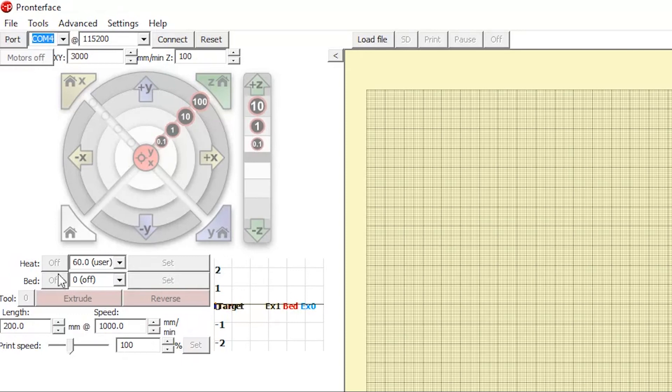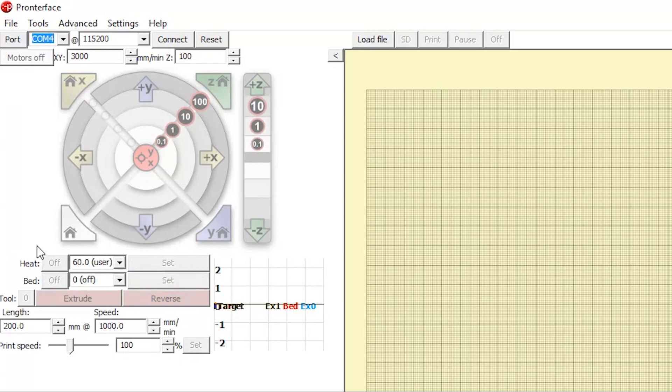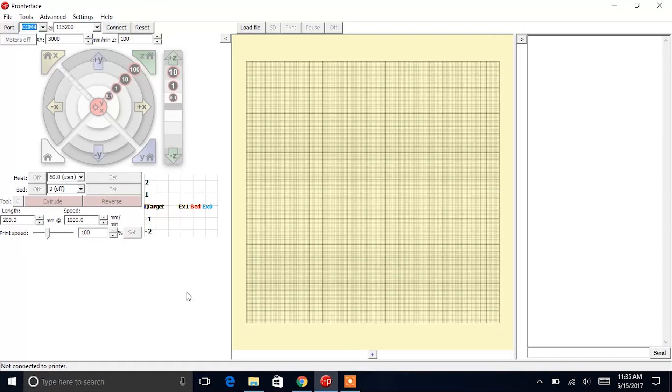Underneath the control panel is the heater control. Here you can enter a temperature for the heater to heat whatever material is inside of your syringe, and you can click set to do that.